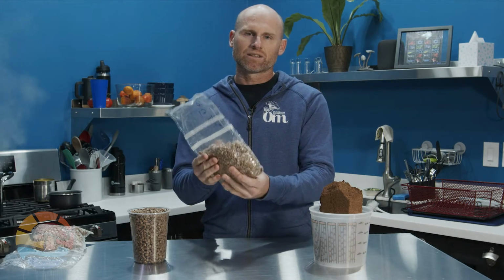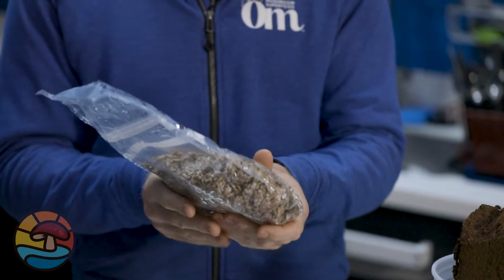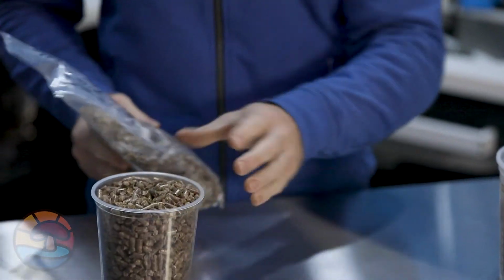And once we have a nice, pure, clean culture, we expand that onto either the grain or the sawdust or some type of special media that we make up to allow the mushroom to propagate and create a nice, sterile media from which the mushroom can jump off of into our substrate. And the substrate provides the cellulose, hemicellulose, and lignin that the mushrooms are going to digest to produce fruit bodies. So let's get going here.